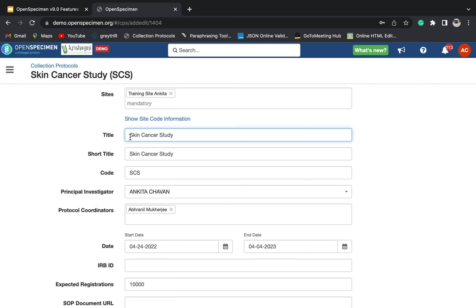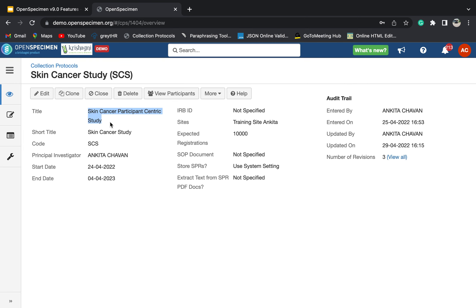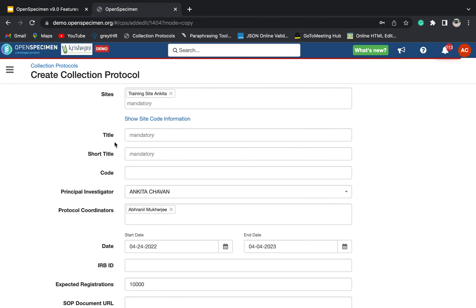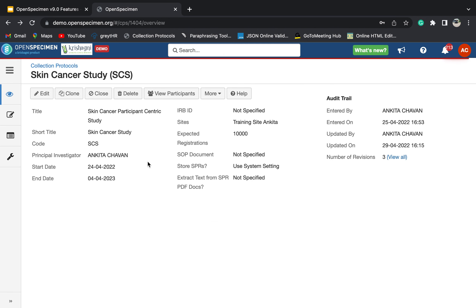There is an edit button if you want to make changes to anything in the CP — for example, if you want to update the title, you can do so and click update. If you see here, the title has been changed. There is another button which is clone. Basically, if you want to create a copy of your CP in your test environment, you can do so by clicking on the clone button. Just the title and short title of the CP will be different; everything else from events to specimen requirements will be copied to the new CP.